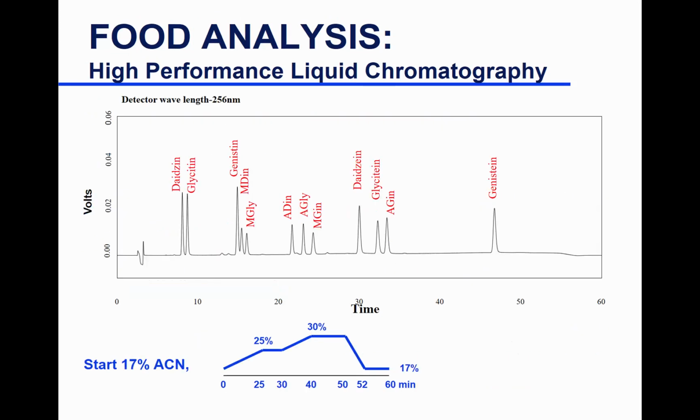Because the mobile phase is polar with acetonitrile, and increasing the concentration makes it more non-polar, like the stationary phase. Yes, that indicates reverse phase. Yes, exactly.